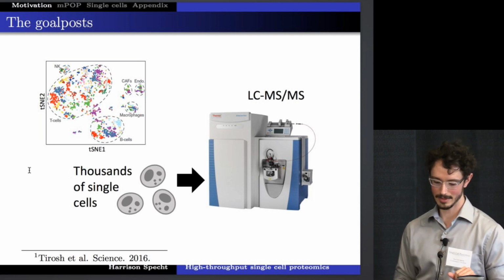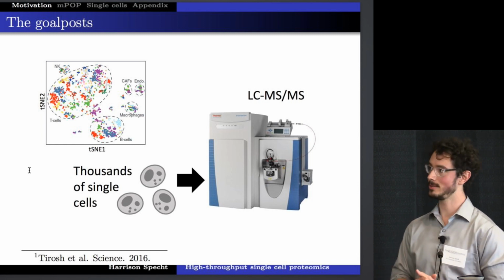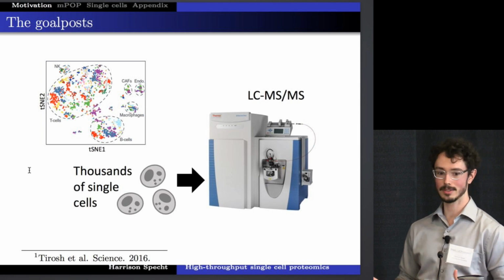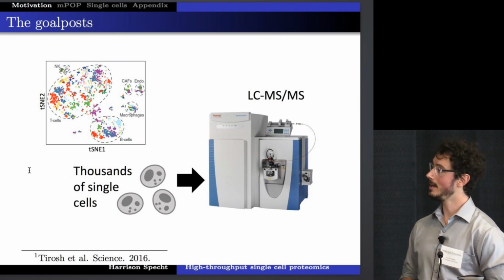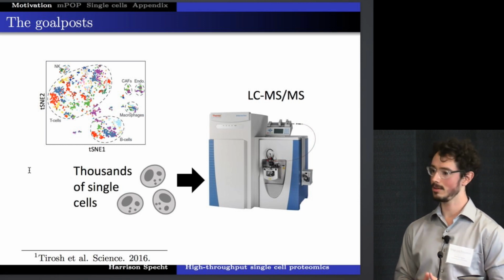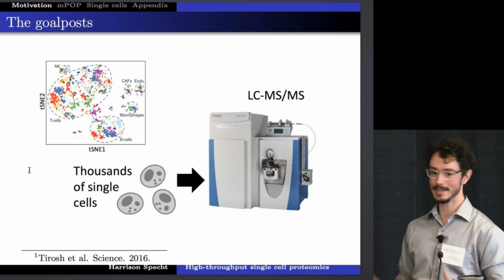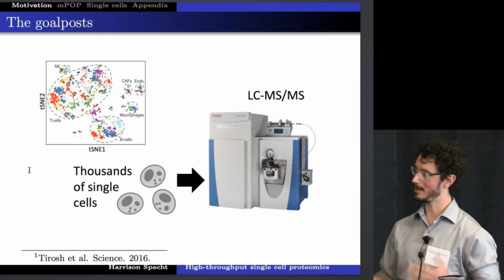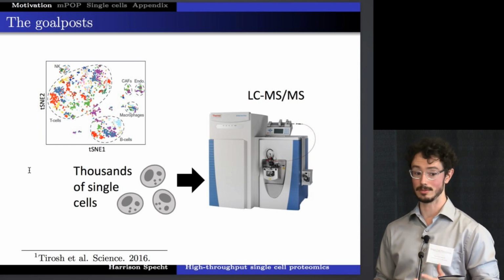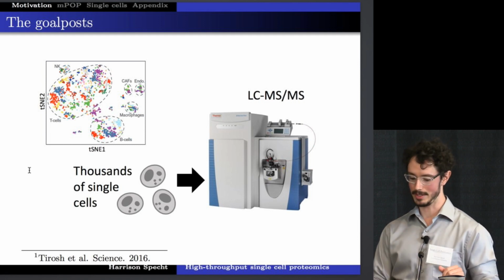Now this slide does sort of woeful injustice to all the things that we've gotten to hear about so far. I think we're all very motivated that we want to do single-cell proteomics, we want to do lots of them, and that it can really show us very insightful things about the subpopulations and all of these models of biology and disease that we want to study. And the main task at hand, and I think we can all agree about this, and it's emerging, is that the sample processing and the sample preparation is really what we want to innovate on in order to make this a possibility.